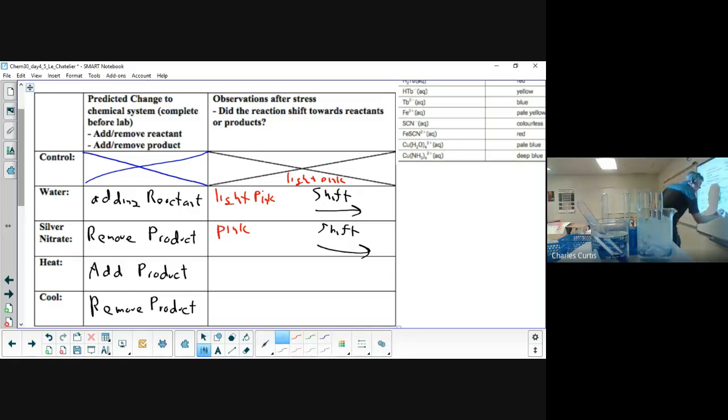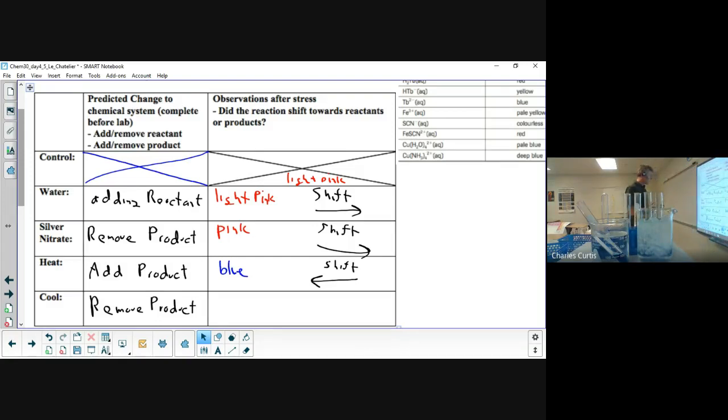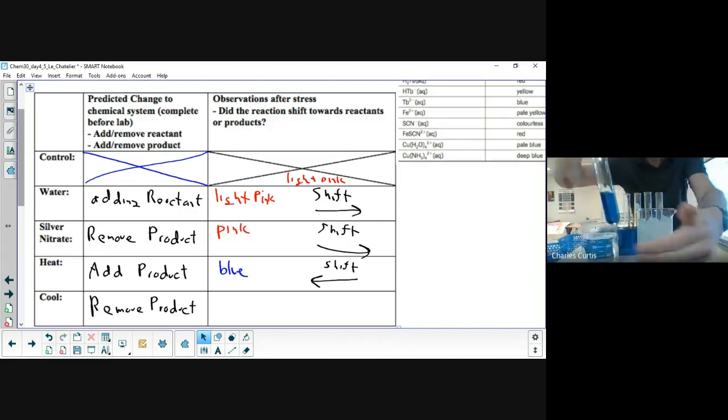So we add a product, our observation is blue, and our shift is reverse because blue means that's a reactant. So it had to shift backwards towards reactants. So that's the opposite. We removed a product, it went towards the product. We add a product in the heat case and it shifted away from it. So I'm going to take the same, my thinnest test tube, just drying it off. So it turned blue when I heated it. Let's see what happens when I cool it.